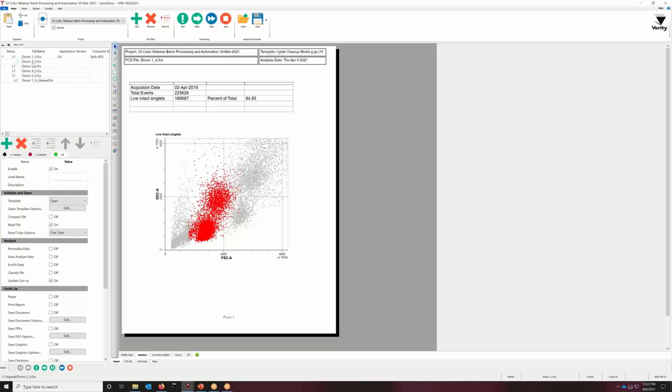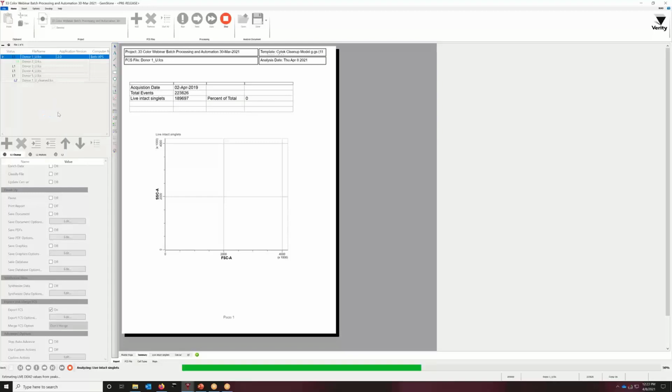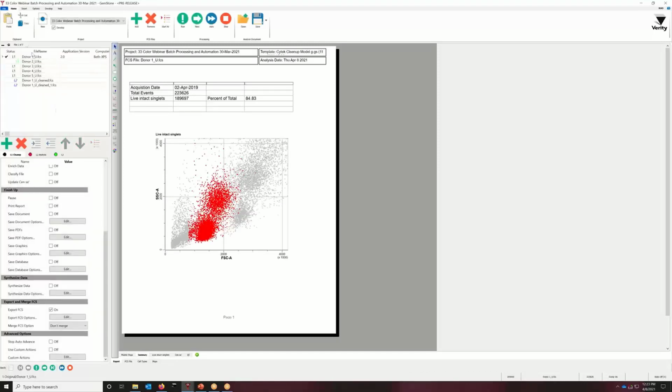And this is actually a way to tell you where you are in that progression of analysis. If you have done just double click and redo that exportation to show you that flag again. So after I've done an analysis, you have this little check mark. So if you've been processing a great number of files and you take a break and come back, you'll see that check mark and you can tell where the progress is in your batch system.